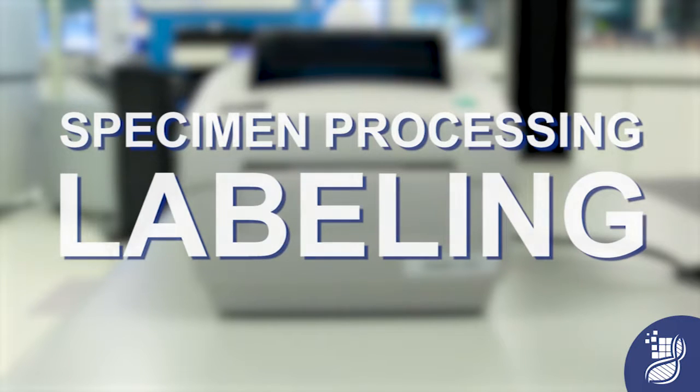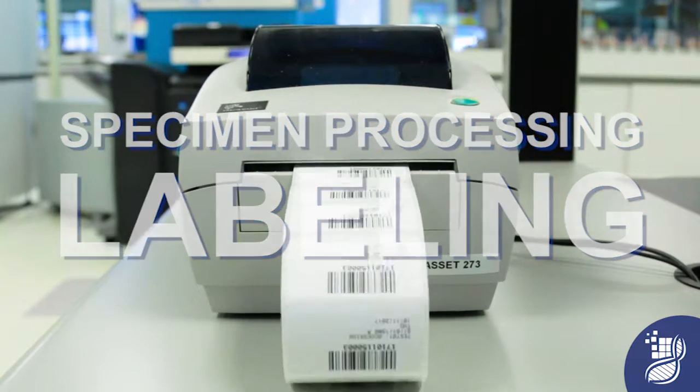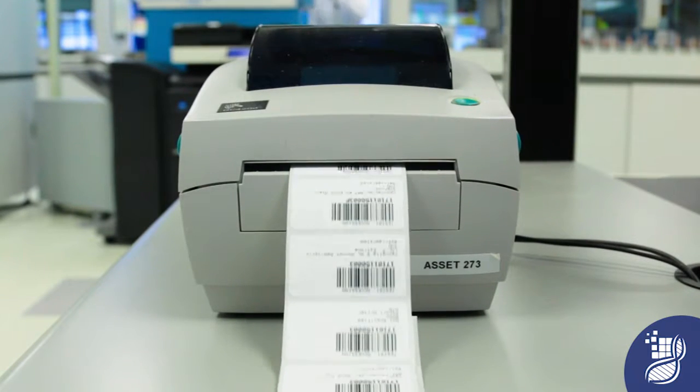Specimen processing, labeling. This video will review the proper way to label using the labels that print from the order entry LIS system, Copia. Upon reviewing this video, you will be able to understand what pieces of information will print on each label and what drives that information, how to properly place labels in their appropriate spots, and how to identify specimen handling or delivery needs as indicated by the labels.